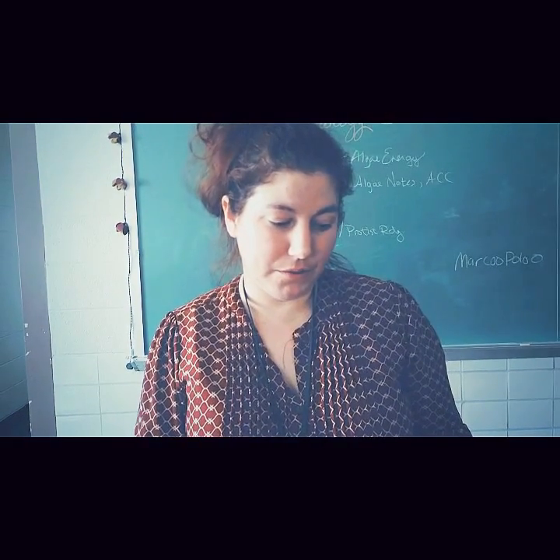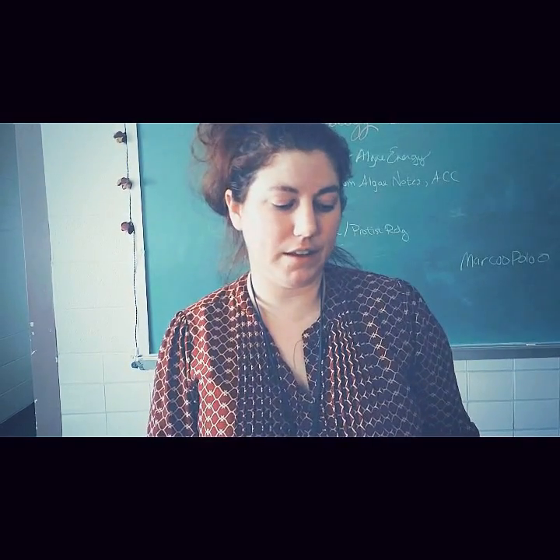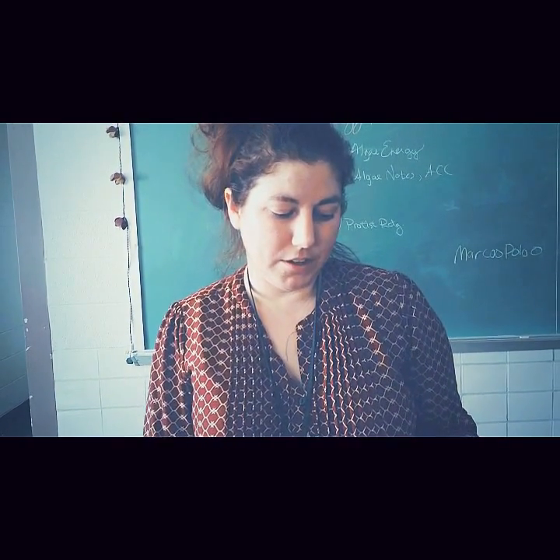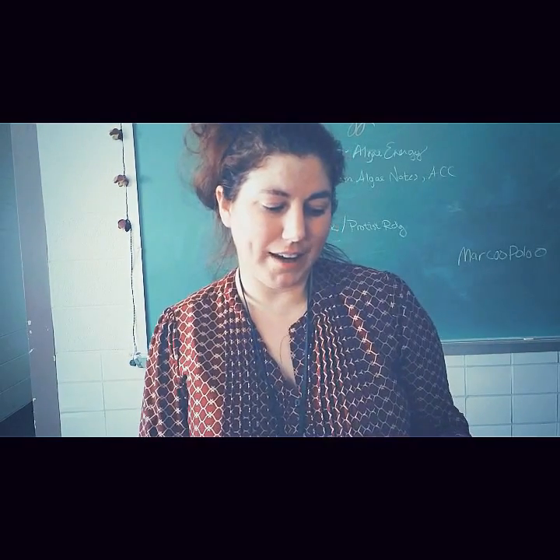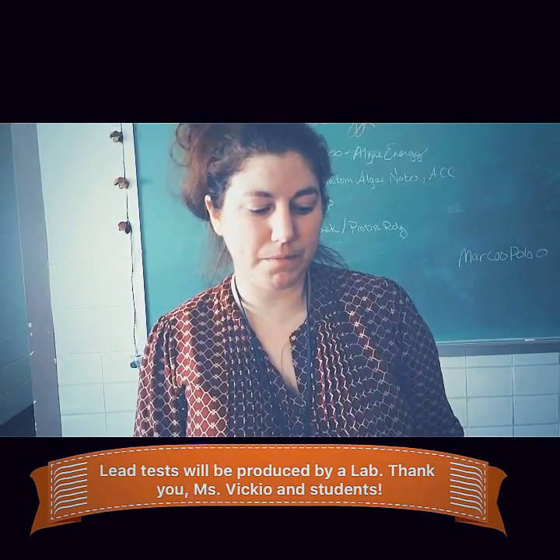Again, it didn't have any chlorine, which is good to see. It was a little bit harder than the bathtub was found to be, but it was still within a normal range. In terms of iron, that one was low, and it had a small amount of copper in it, which can likely be attributed to the lower pH compared to the bathtub.